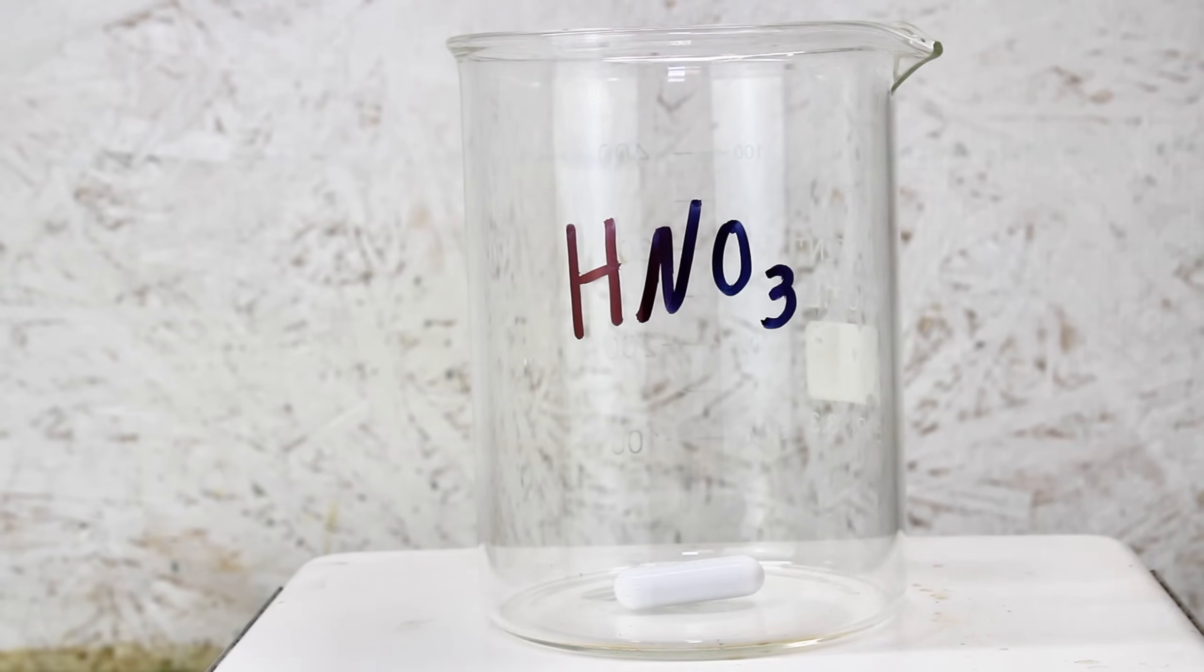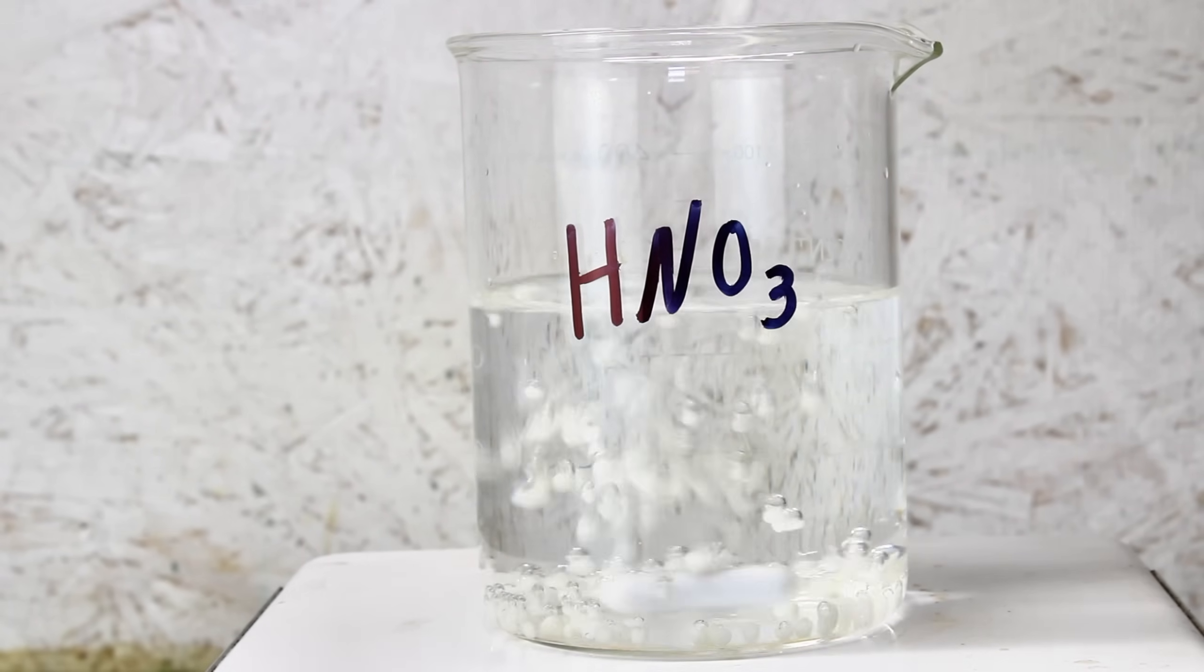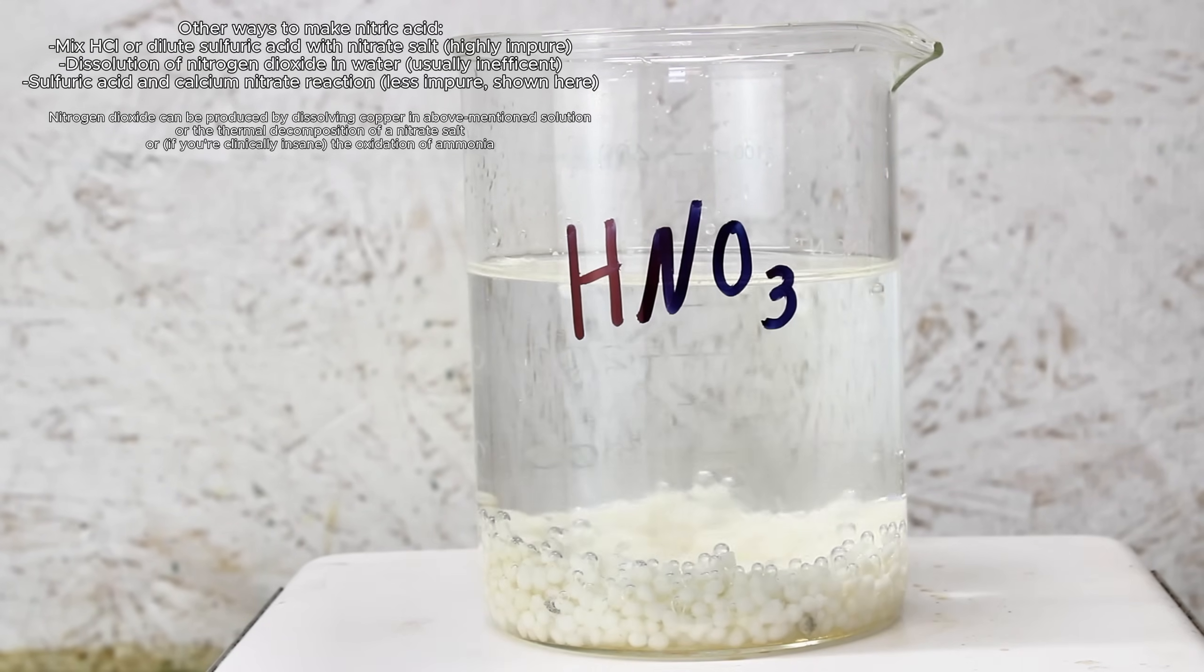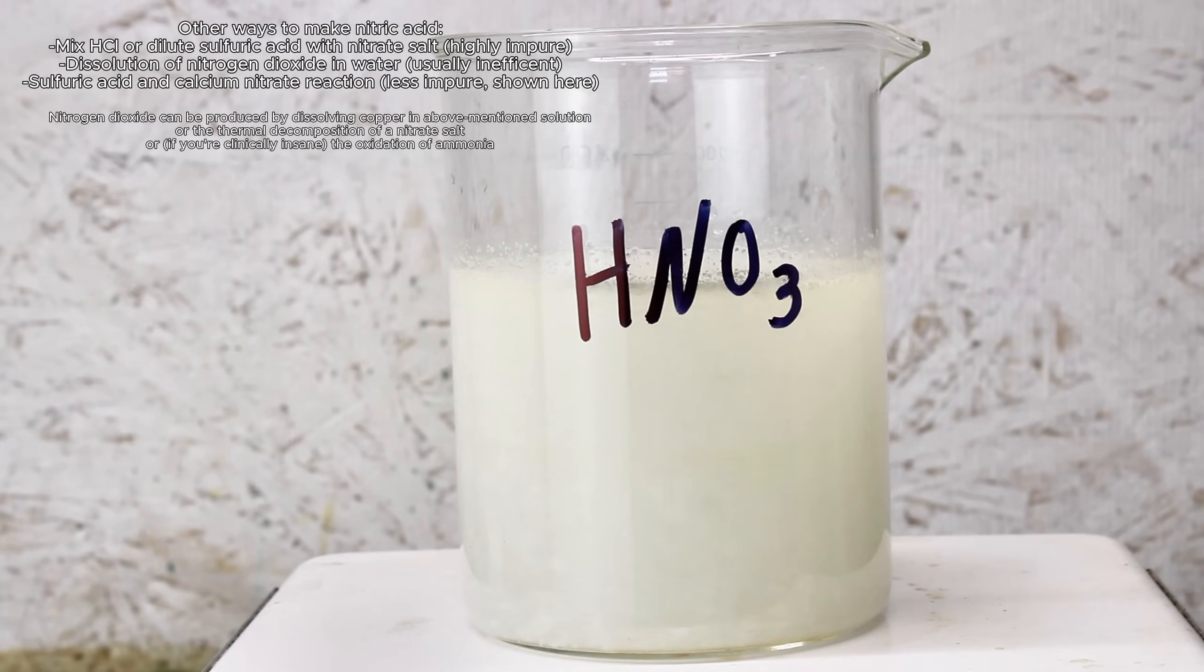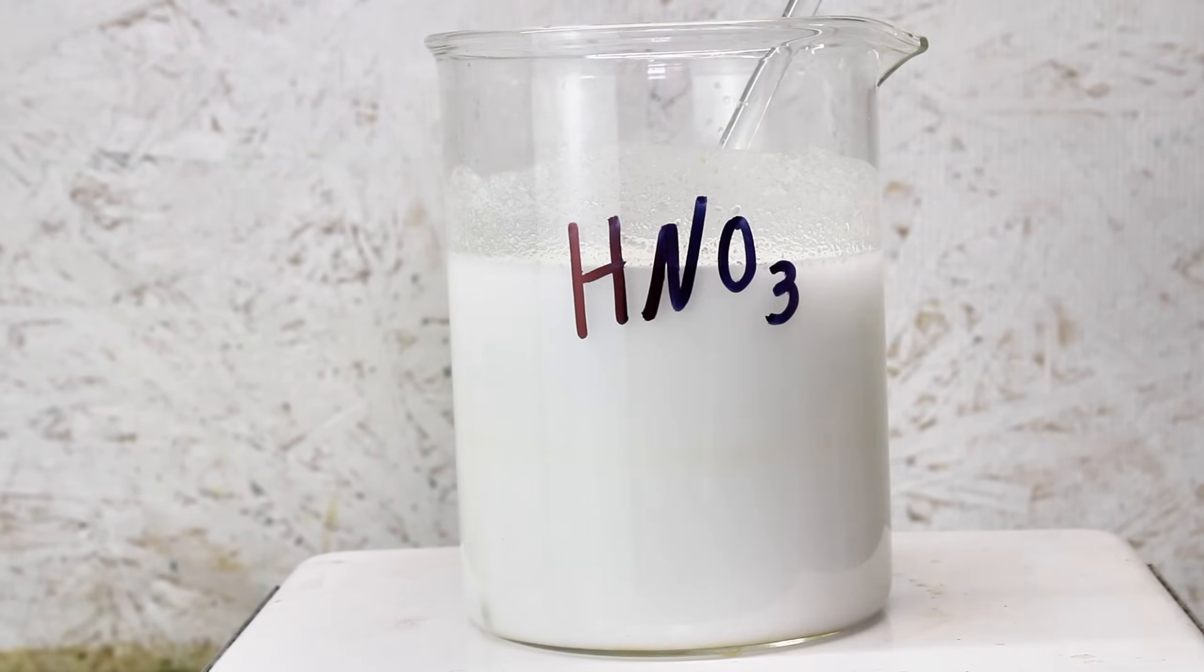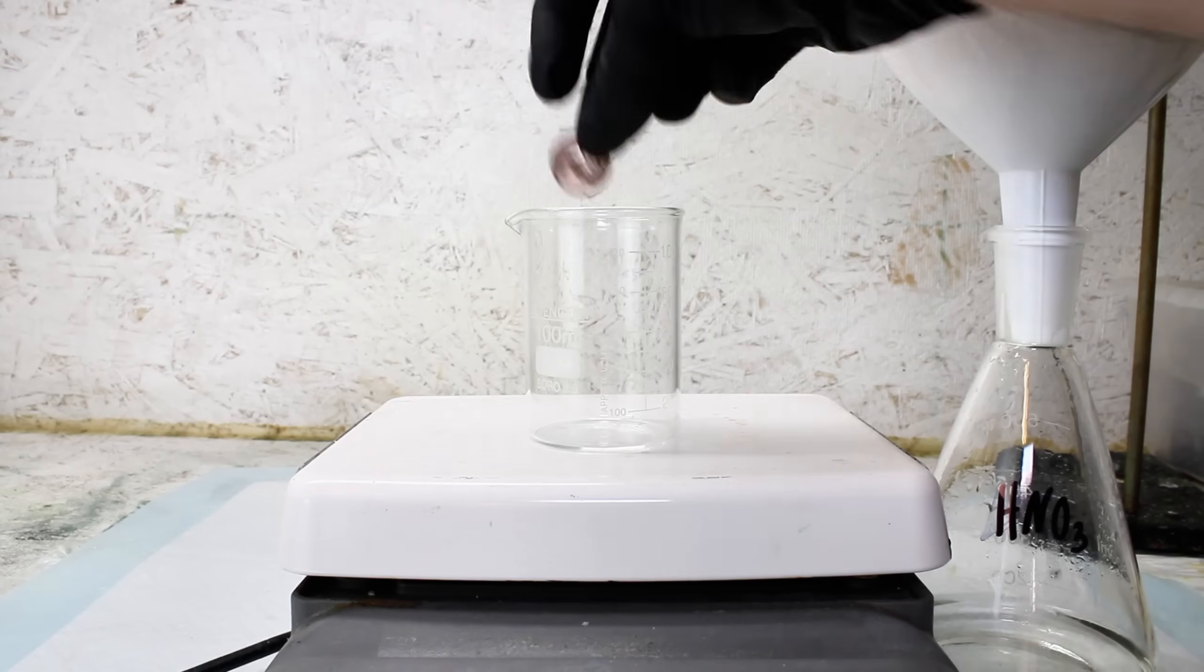Now, those are definitely the best ways to make hydrochloric and nitric acid, but they certainly aren't the only ways. The easiest way to make nitric acid would probably be to either dissolve sodium nitrate in hydrochloric acid if you can tolerate the sodium chloride impurity, or by dissolving calcium nitrate in some water and then adding some sulfuric acid until no more calcium sulfate precipitates. This will result in a fairly weak and notably impure nitric acid, but it's chloride free, relatively free of other contaminants, and viable for a few applications.